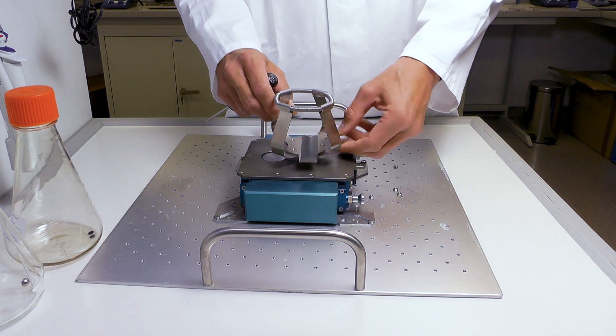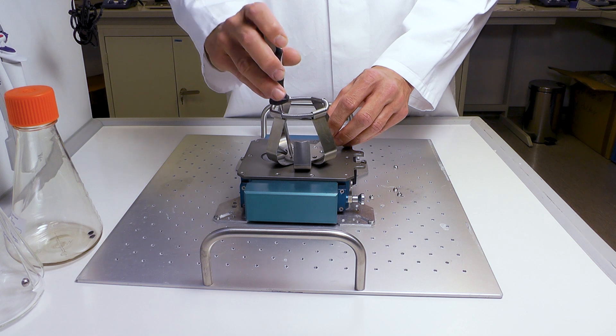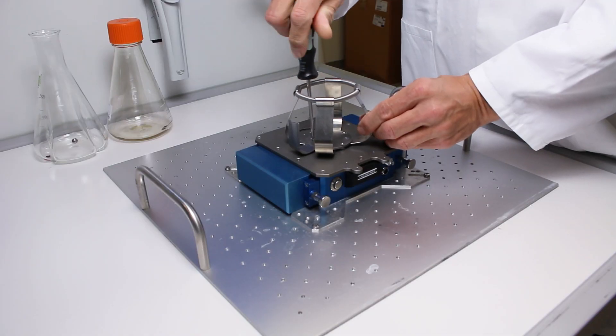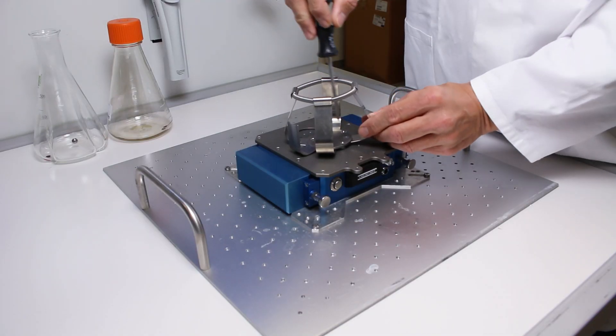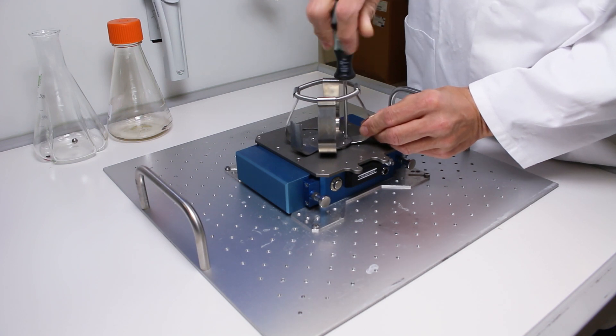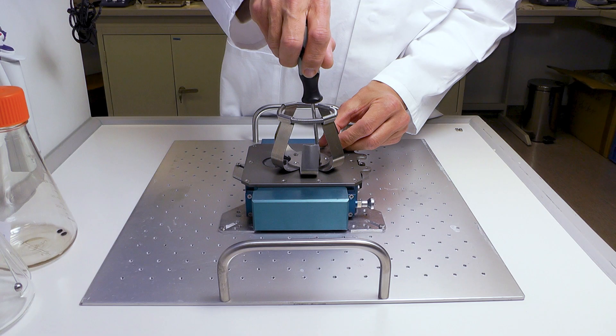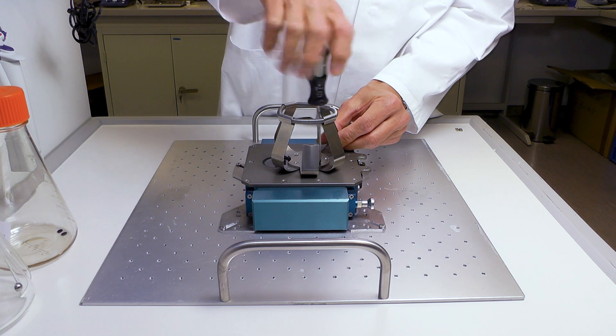Position the clamp in such a way that the recess in the base plate faces the reader optics. Press down on the clamp and attach all four screws loosely. Then tighten the screws crosswise.